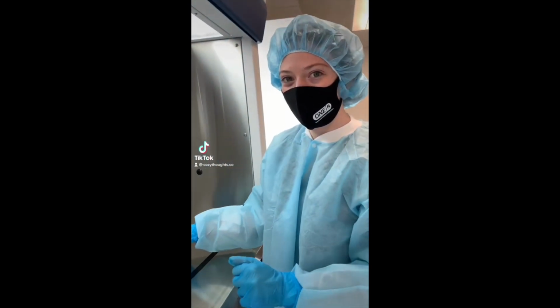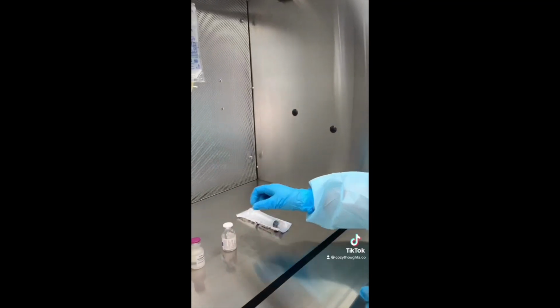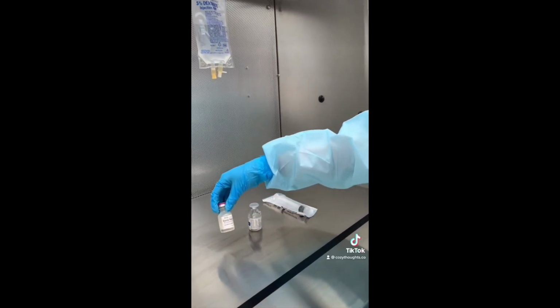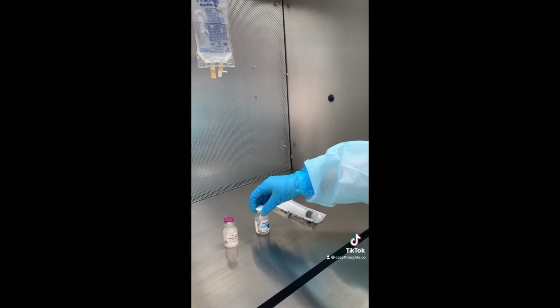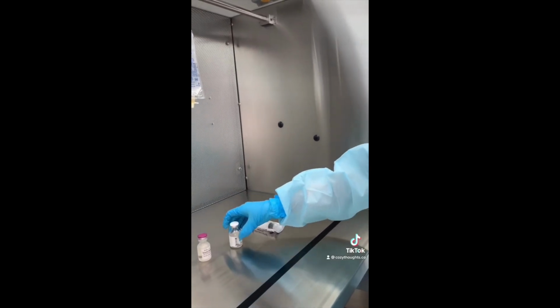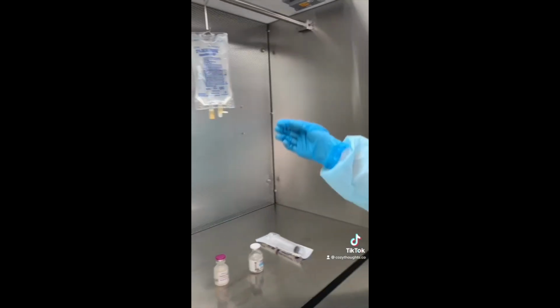So what we need to do is take the syringe and take 10 milliliters of the water and inject it into the sugar. And then once that is reconstituted, we will inject that into the IV bag.